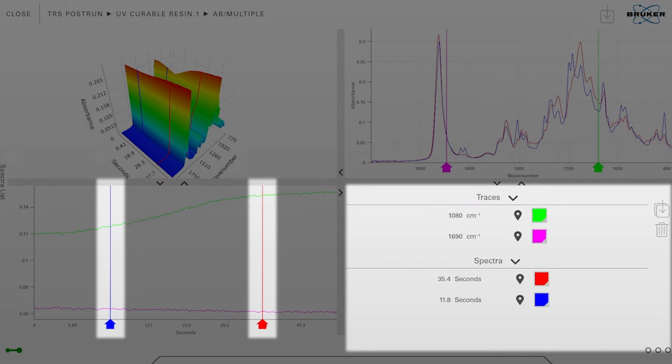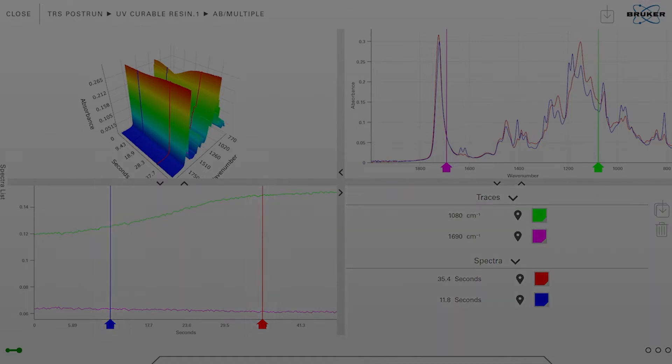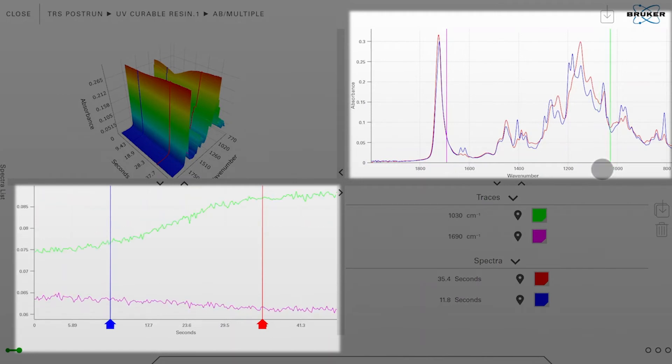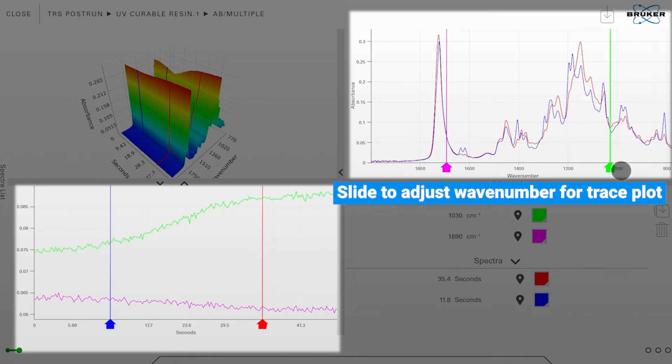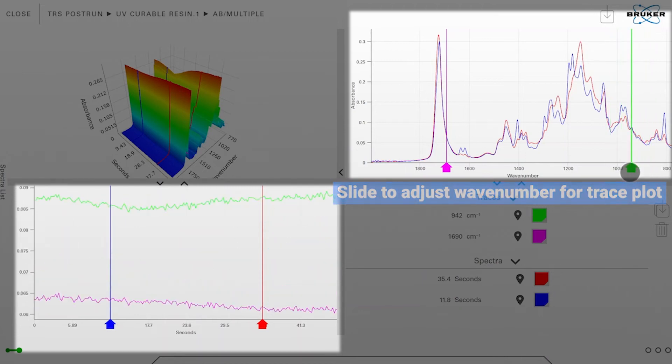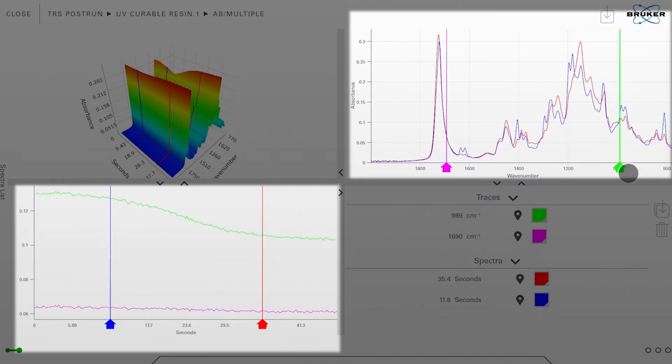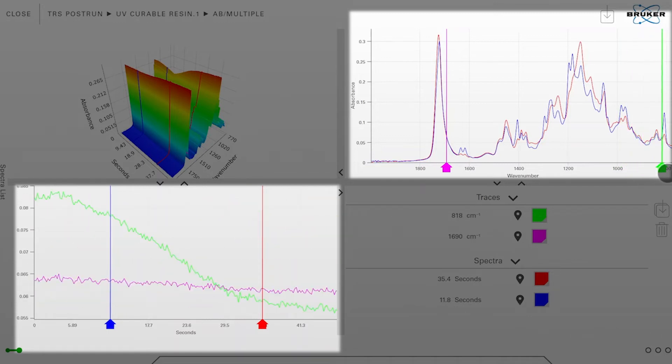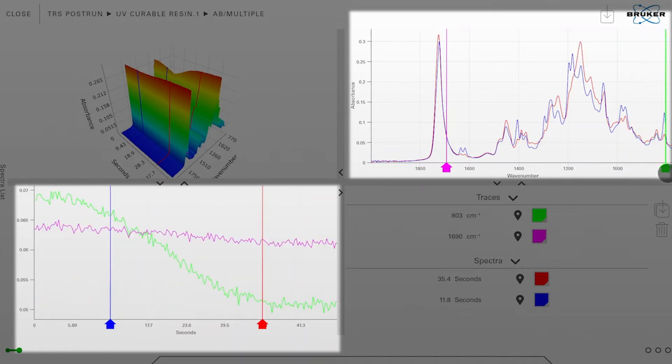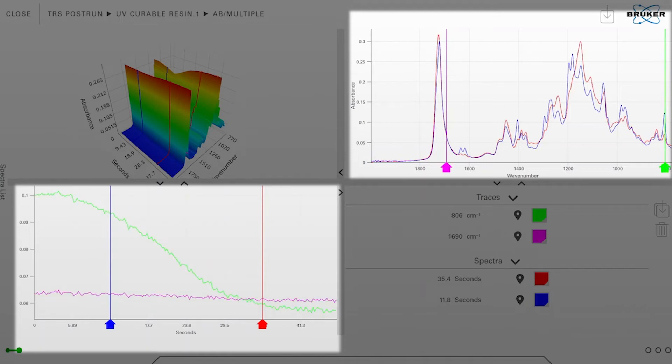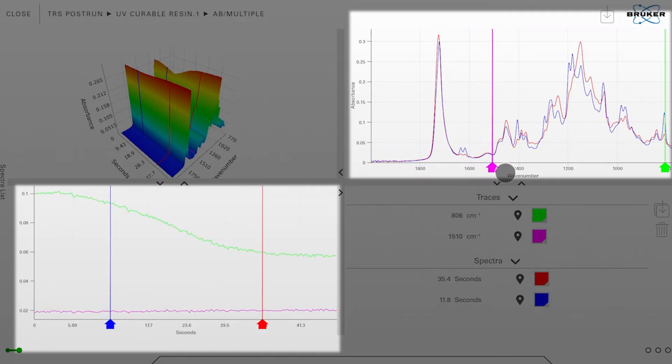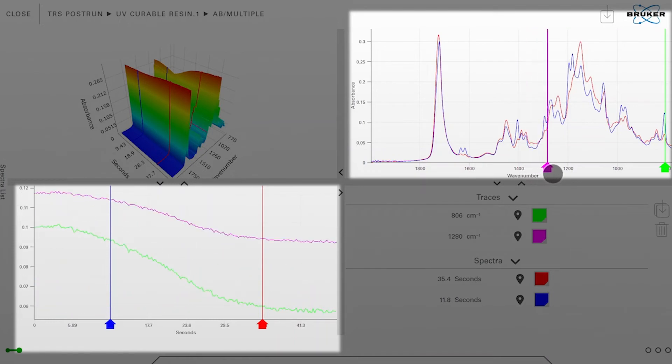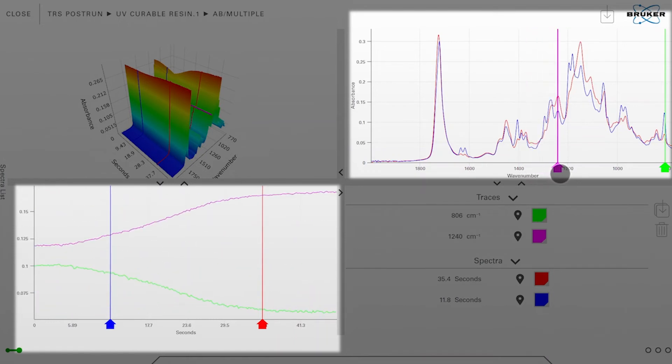Now we can arrange all these markers. So for example if I tap on the green one, I can move it around here and set it for example at a position of approximately 806 wave numbers, and the pink marker I will move to a band at approximately 1240 wave numbers.